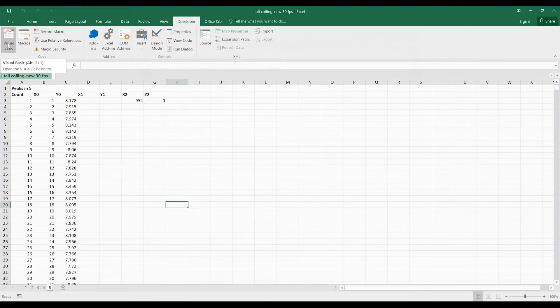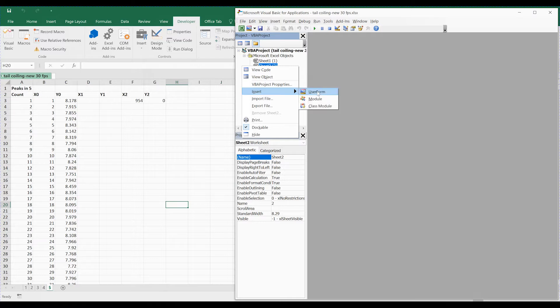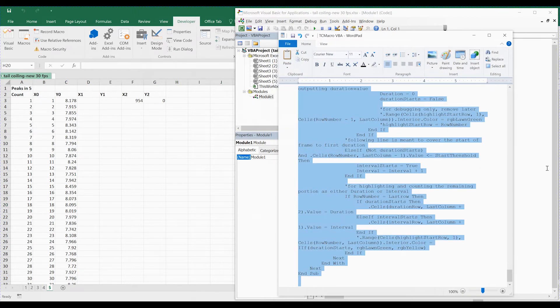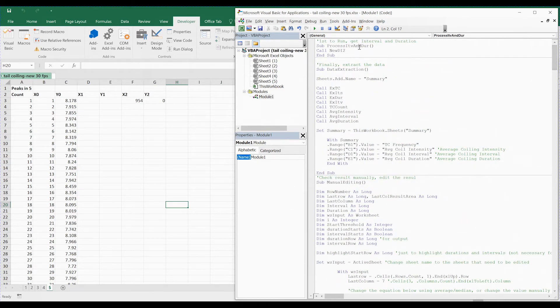You need to open Visual Basic by clicking this button or using the shortcut Alt+F11. After you open it, you will have a new window for Visual Basic. To run the macro, you need to add a new module first. Add the new module by right-clicking on the sheets or any area, then Insert > Module. You will have a new empty module, and you just need to copy the macro we provide into the module — paste it and you already have the macro.